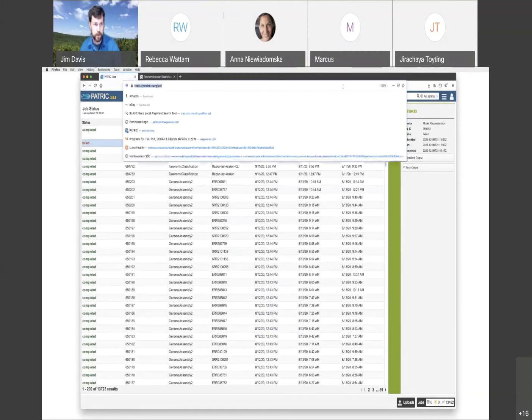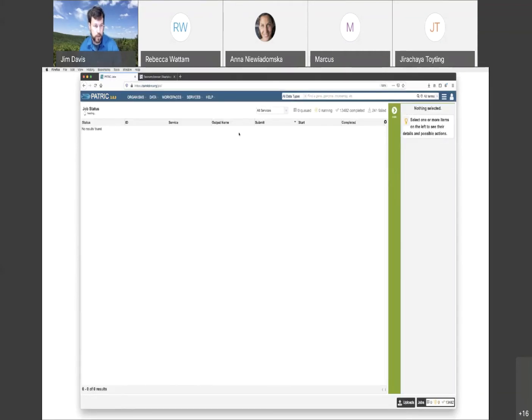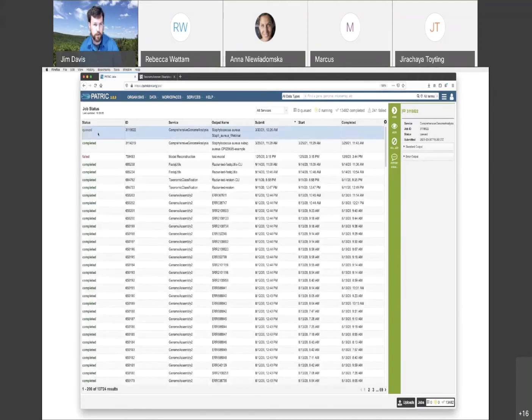But it is, I'm going to refresh the page here and see what happens. And here we go. There it is. It's queued.